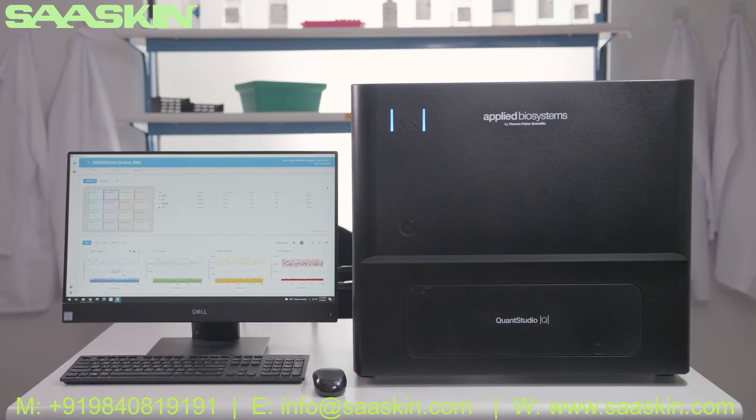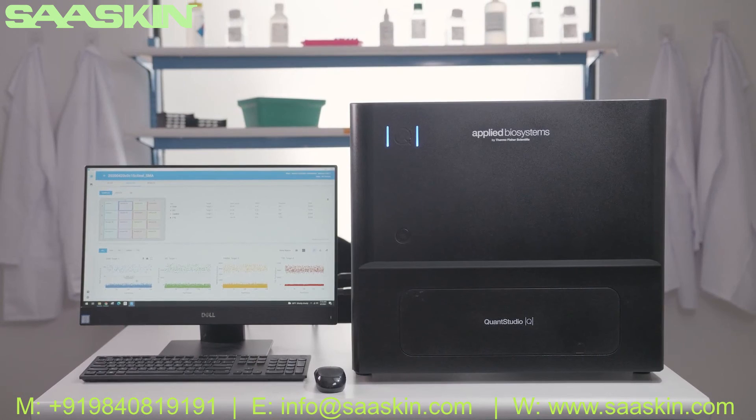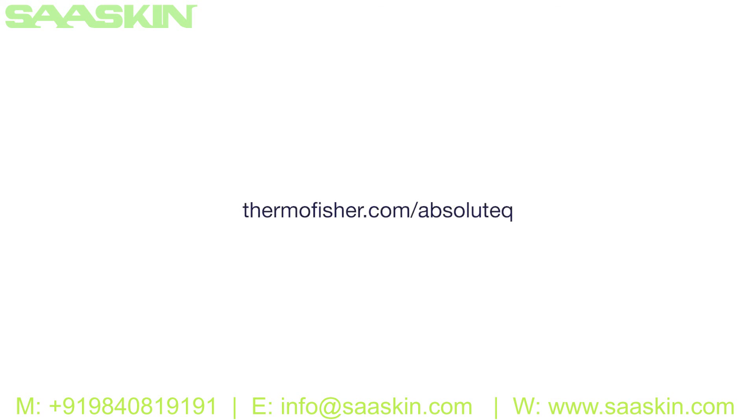QuantStudio Absolute Q Digital PCR System from Thermo Fisher Scientific. Experience the future of digital PCR at thermofisher.com/absoluteq.